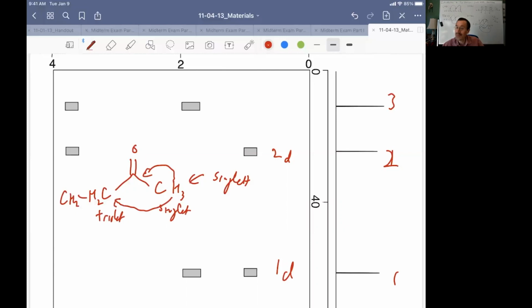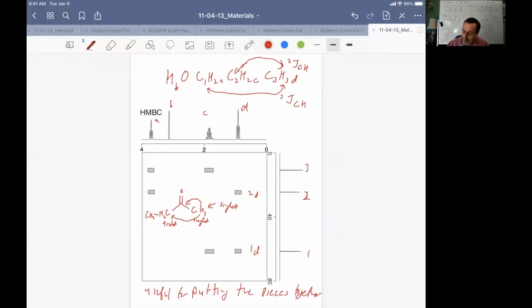But you know that that methyl group isn't J coupled to that carbon that has the triplet on it, because they would otherwise split each other, and it's a singlet. So then you'd say, aha, that isolated methyl group must be on the carbonyl. And you'd be able to place it that way. So it's usually a logic exercise. Other questions? Good question.